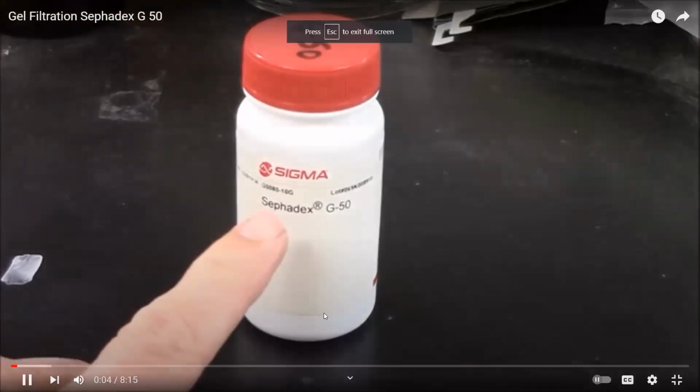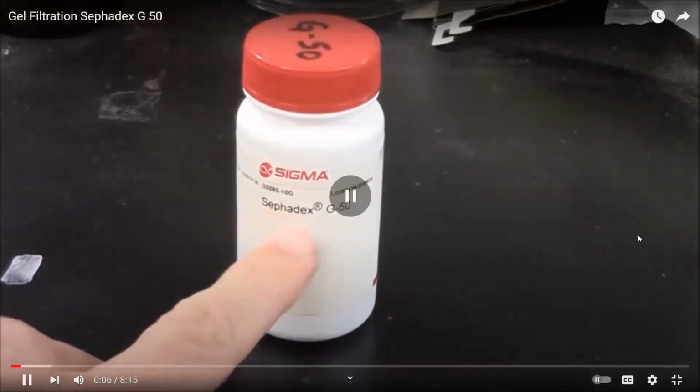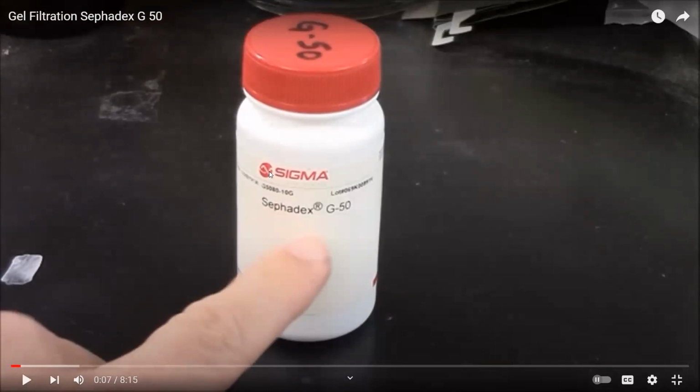We're starting with gel filtration medium. This is Sephadex. Sigma provides this extra pure material. That is your stationary phase. The dex stands for dextran, and Sephadex is the commercial name. So if there is a dex suffix, you must know that the polymer material is going to be dextran. If it is agarose, then it is Sepharose. So if it is rose at the end, then your polymeric material is agarose.